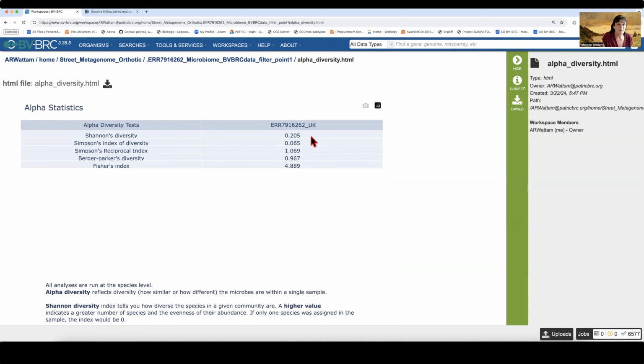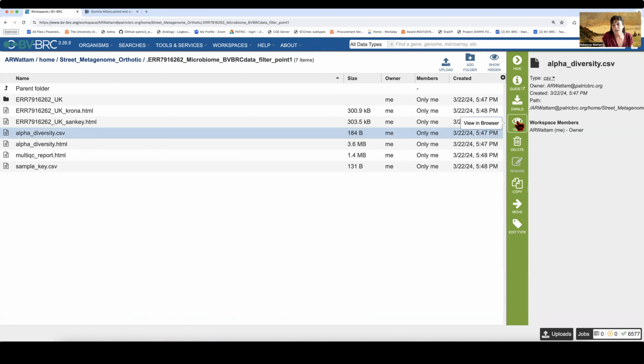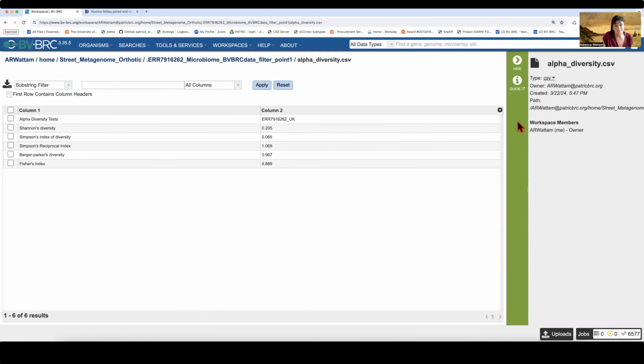So the reviewer would think, oh, this person knows what they're doing. Okay, let's click back on the breadcrumb here. Breadcrumb like Hansel and Gretel leaving breadcrumbs to march their way. So the comma separated value, we highlight the row, click on the view icon, same thing. If there was a lot of stuff, you could use the filter to look for things, but pretty self-explanatory.